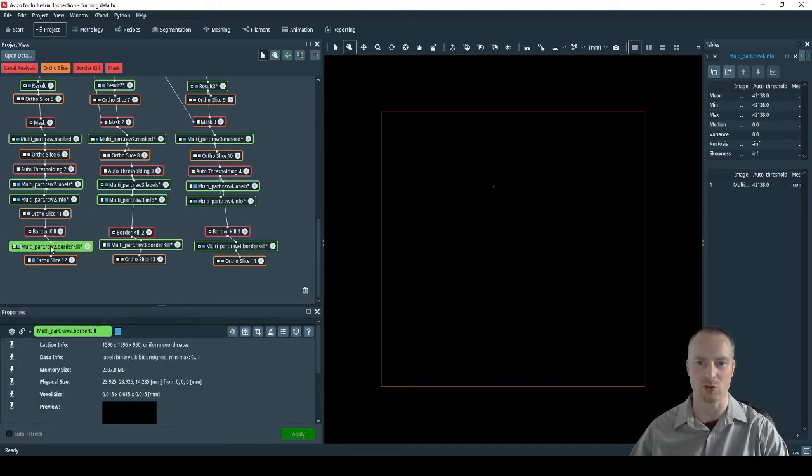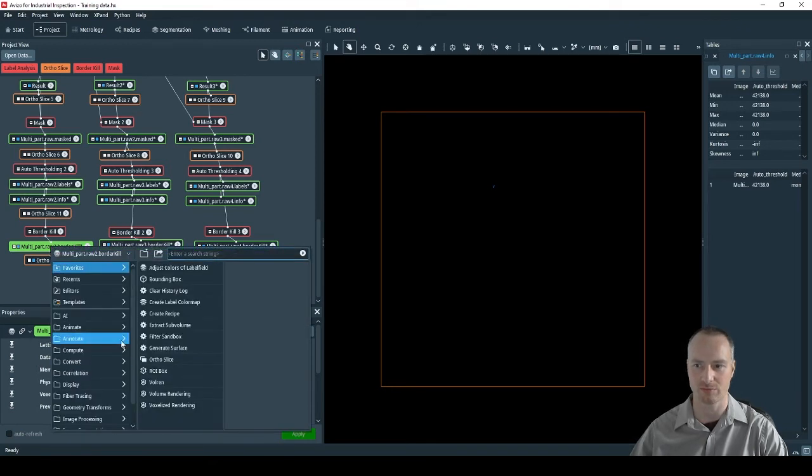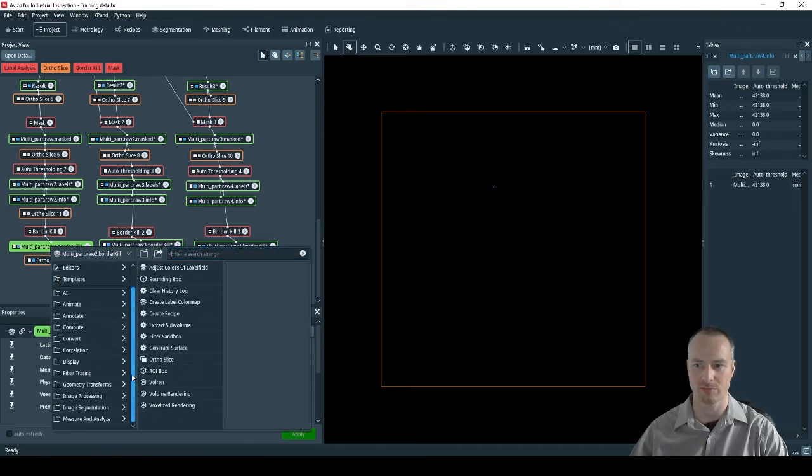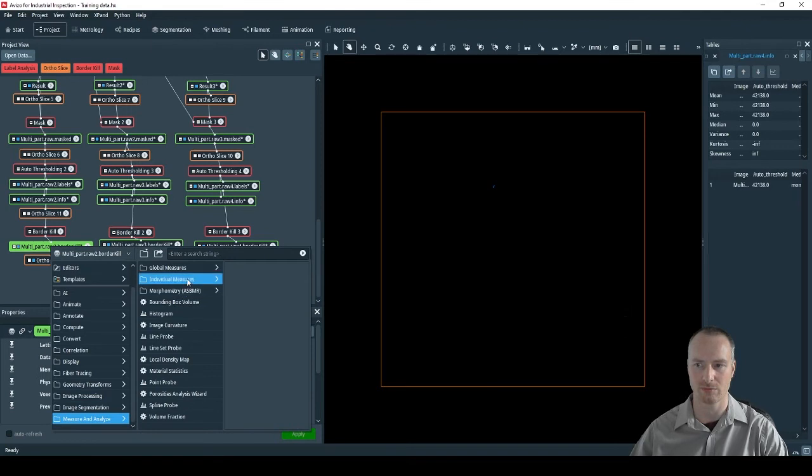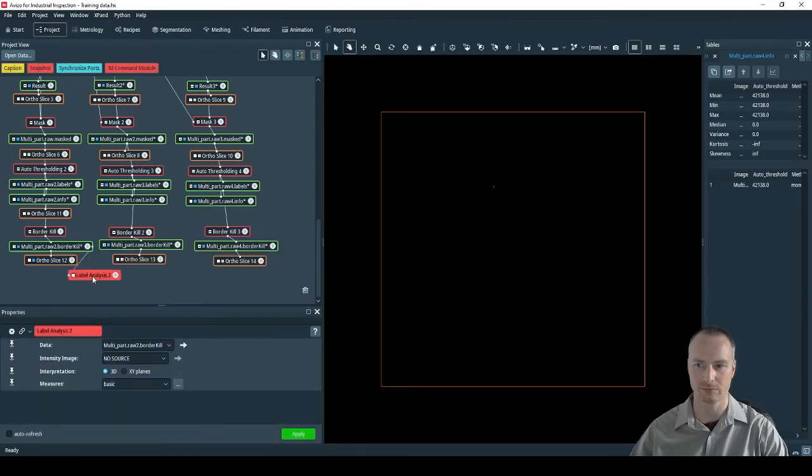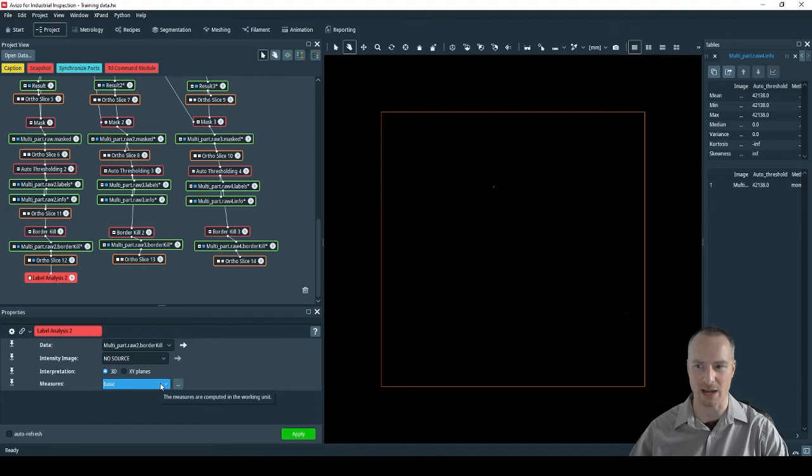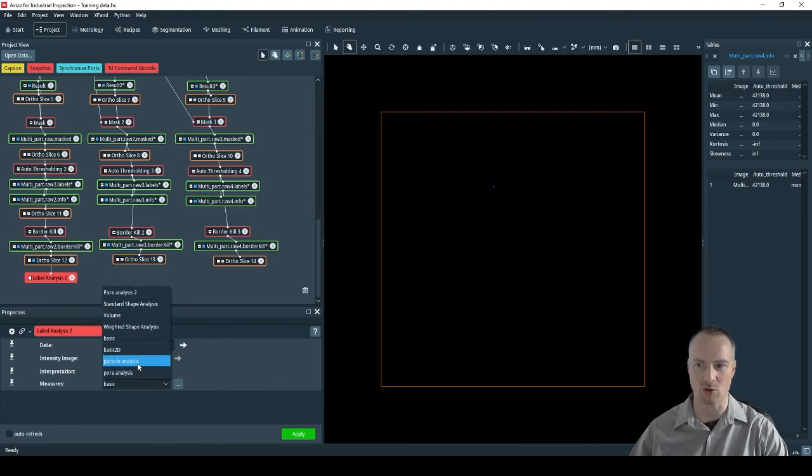To analyze the pores we will use a label analysis. This can be found under the measure and analyze folder. I have already put together an analysis package which I will call particle analysis.